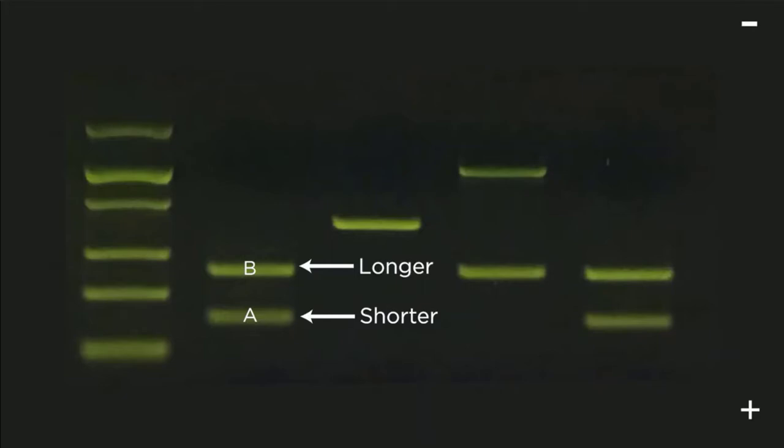But usually, we want to know the actual length of the fragments of DNA we are separating. To better assess the size of our DNA fragments, we typically add a DNA ladder to one of the wells. In this gel, the ladder is in the leftmost lane. A ladder is a sample of prepared DNA fragments of known lengths that acts like a ruler we can later compare our DNA samples to. The smallest fragment, which is only 100 base pairs, will move the farthest through the gel, then the 200 base pair fragment, the 300 base pair fragment, etc.